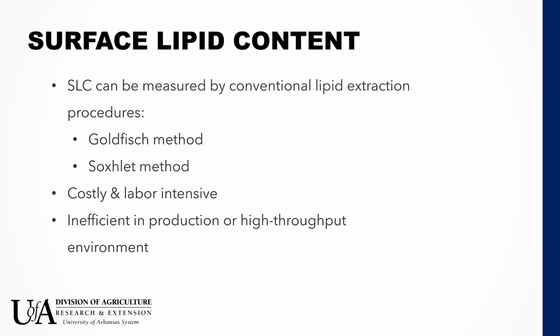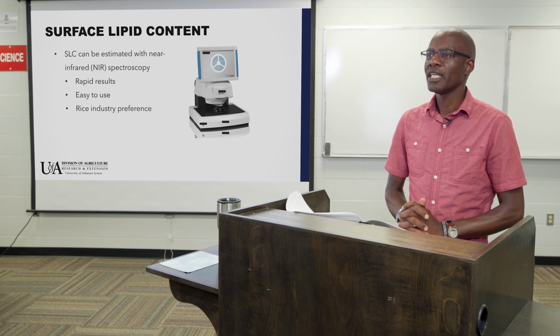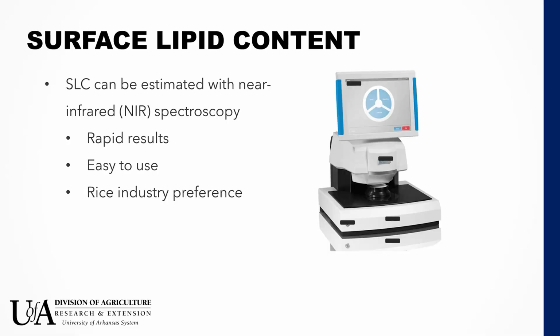So there's a rather simpler method, and this is a technique that uses NIR. This is a rather rapid method. It provides very rapid results. It's easy to use, and is one of the most preferred by the rice industry.